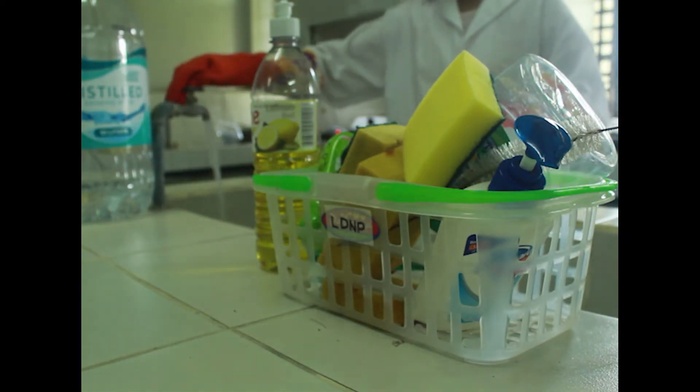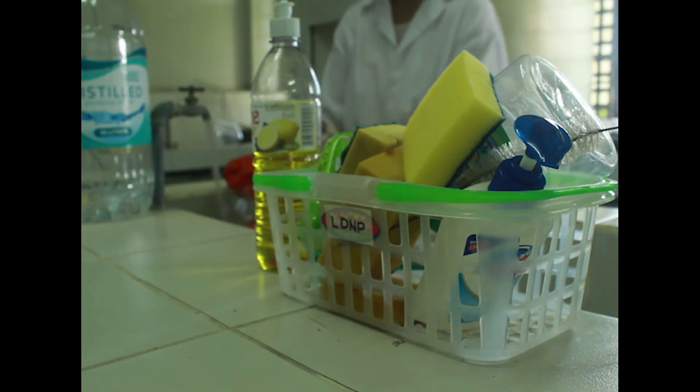While waiting, I wash my other laboratory materials that I used yesterday.